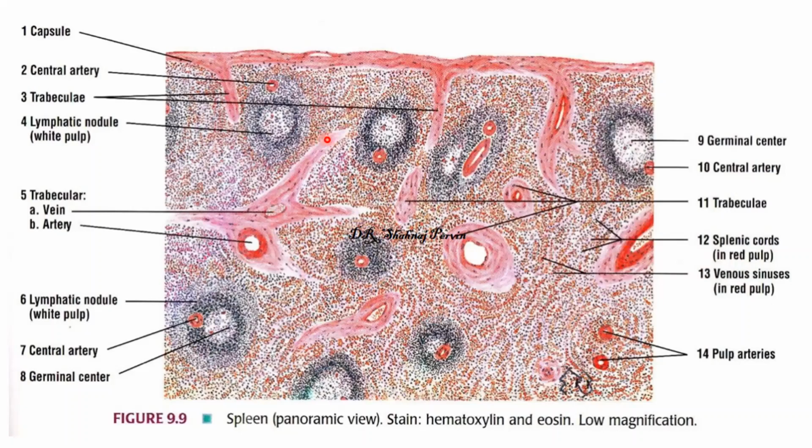So the histological structure of spleen, if you get a tissue like this, your identification will be what? Outer capsule, inside parenchyma. Parenchyma has the red pulp and the white pulp. White pulp is characterized by the central arteriole and the lymphatic nodule. Around the central arteriole, the periarteriolar lymphatic sheath contains T lymphocytes, and the lymphatic nodule contains B lymphocytes. The red pulp contains blood cells. The blood cells form cords, called the splenic cords, and the splenic sinusoids. Just keep remembering.